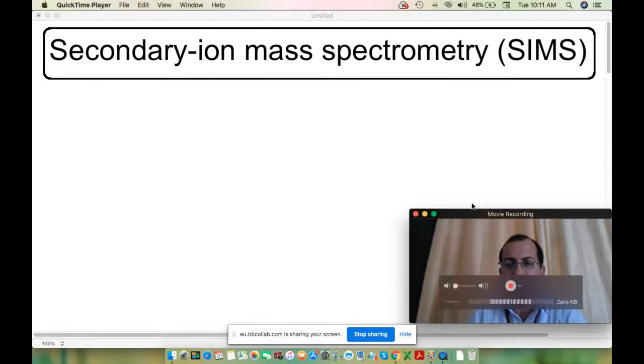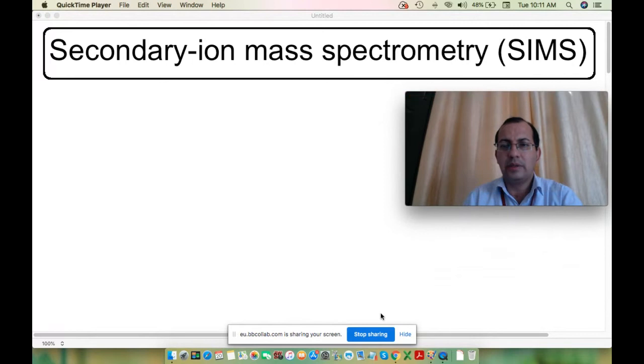So what we have done till now, in the case of FTIR spectroscopy, is very straightforward: we are trying to excite the rotational and vibrational states of the molecules. Most materials have their fingerprints in that region.